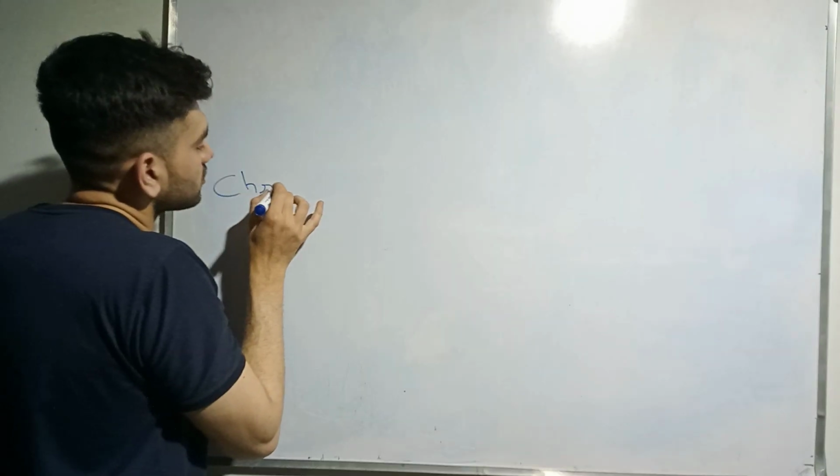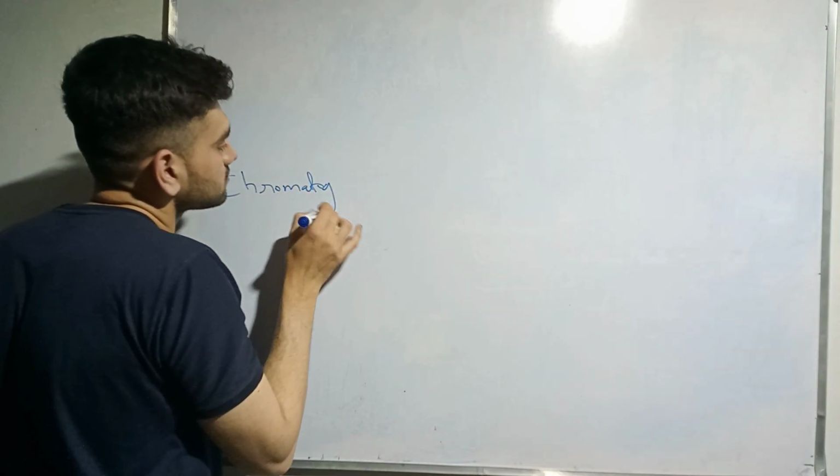My name is FZSON. Today we will discuss the results of HPLC. Actually, HPLC gives us results in the form of a graph, and this graph is called a chromatogram.